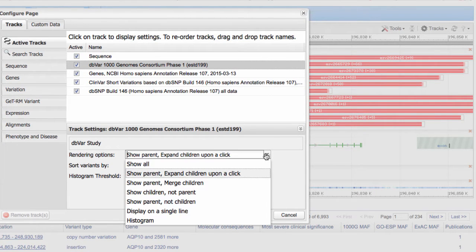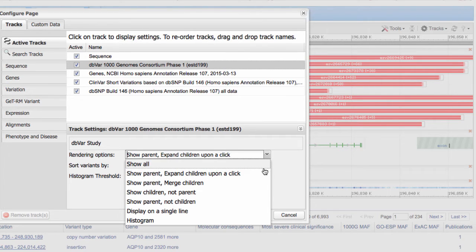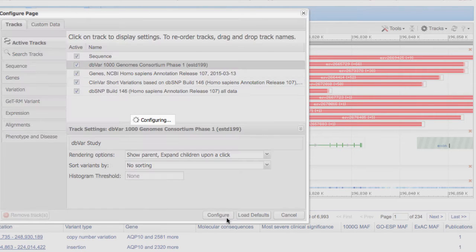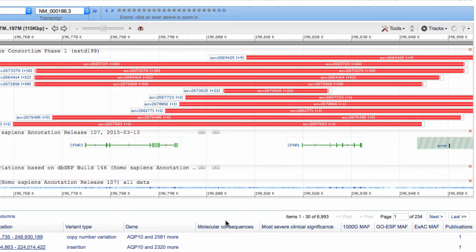Then in the pull down menu for Rendering Options, select Show Parent Expand Children Upon a Click. Then click the Configure button, and you are all set.